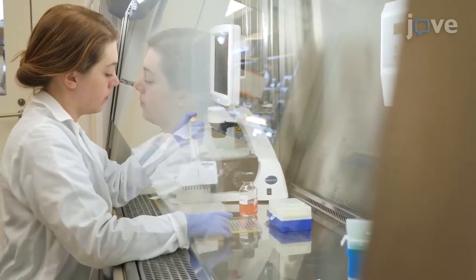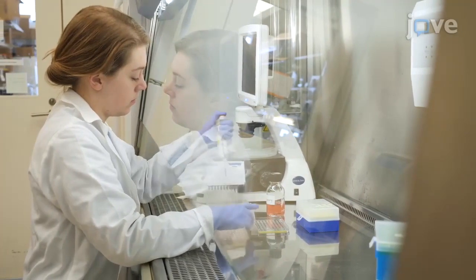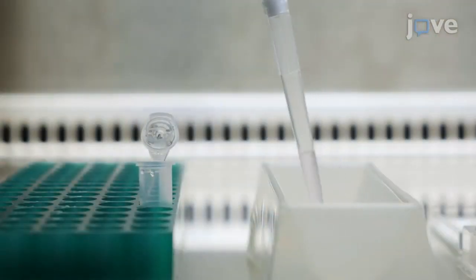Replace the NBM with 100 microliters of previously prepared NBKY solution per well. After 20 minutes, pipette 50 microliters of the transfection reagent and DNA mixture.